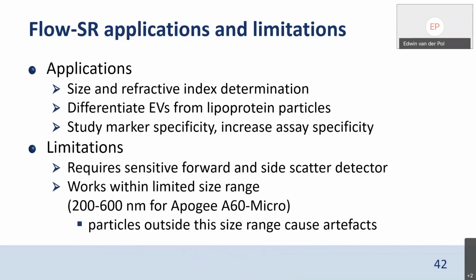So to some applications, but also limitations of flow SR. Applications are size and refractive index determination. You may use that to differentiate EVs from lipoprotein particles, for example, to study marker specificity. We may also use this to increase the assay specificity.